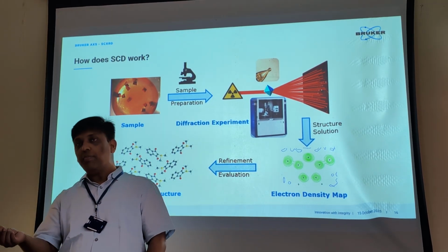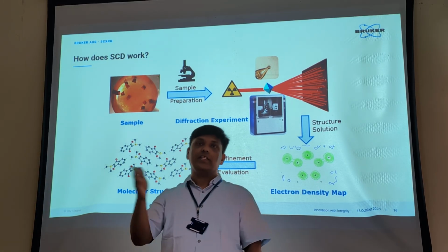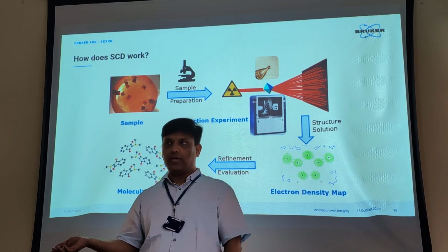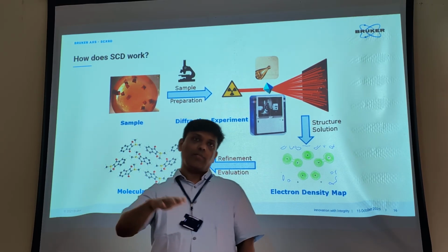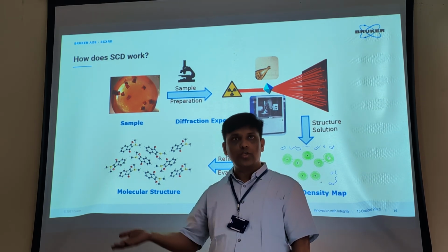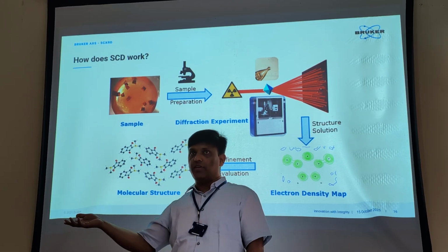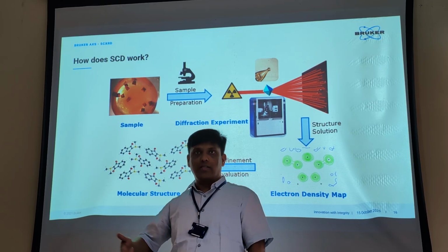What they do is take a sample and dissolve or supersaturate it with the solvents in which it gets dissolved, and then let it cool or let it evaporate, and there is a high chance of getting single crystals. Sometimes you need to use a mixture of solvents, different solvents, sometimes water and other things. Slow evaporation is the most used method. And with different ambient conditions, you can put it in the fridge, in the glove box, or outside. You might see that at different times of the year you will have different crystallinity.